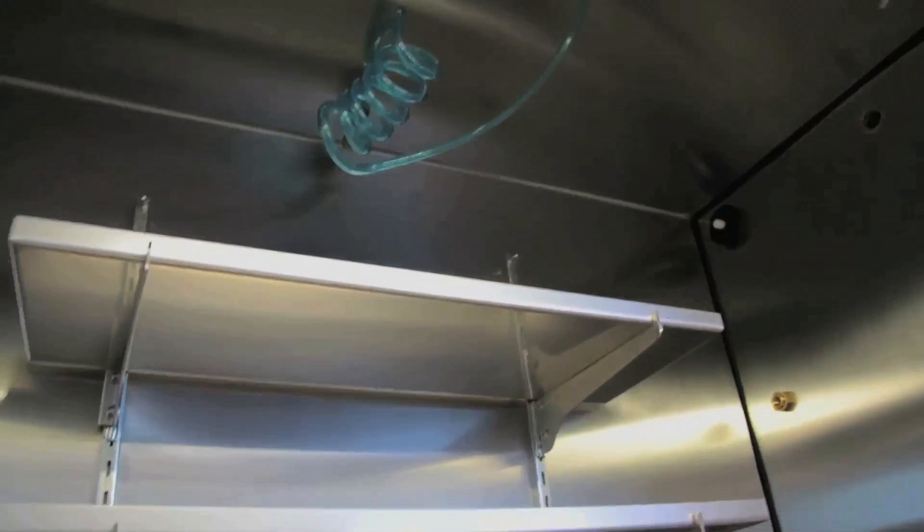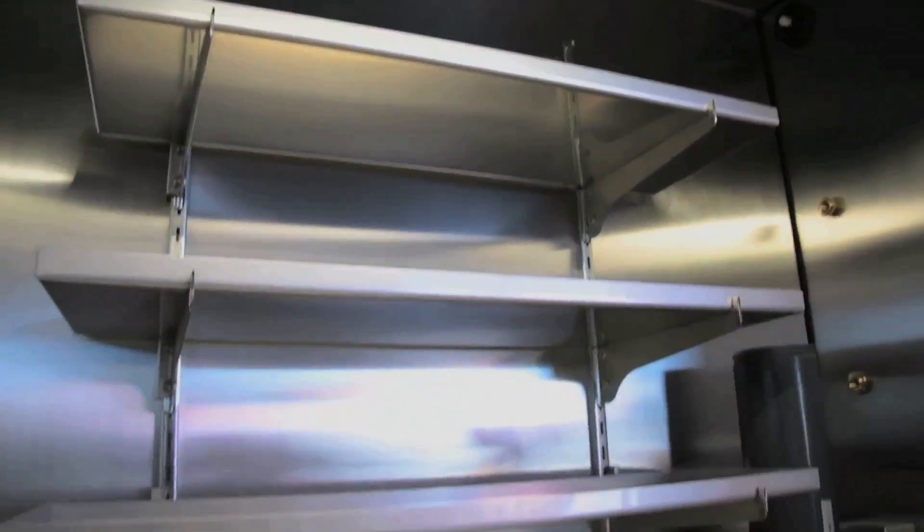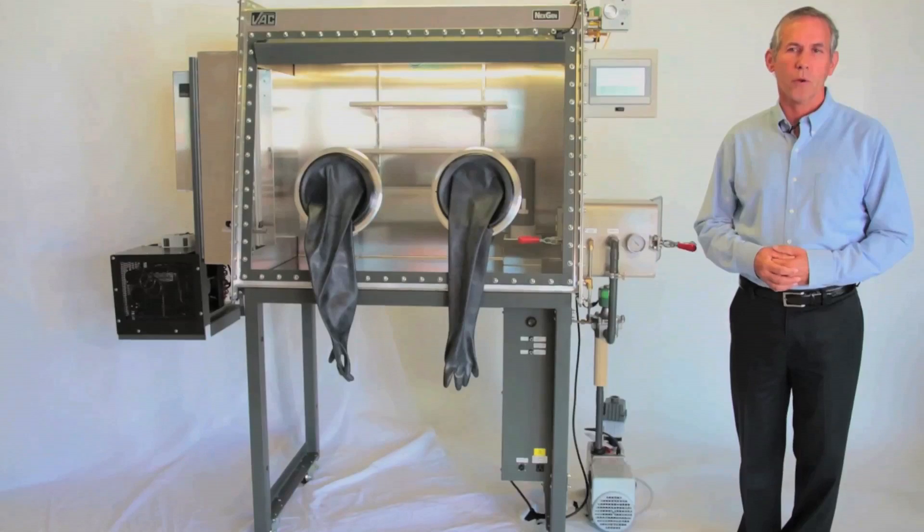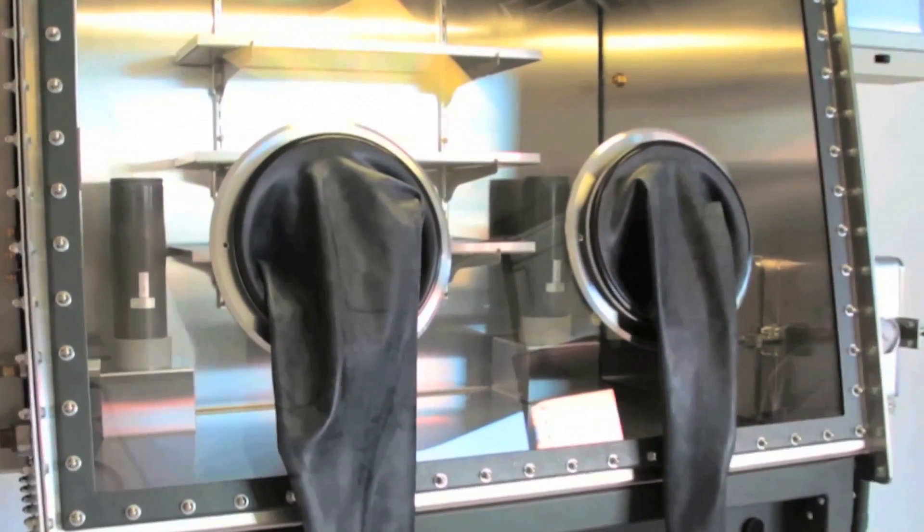The NextGen will maintain an inert atmosphere with less than 1 ppm oxygen and moisture. It uses two separate compact purifiers, one each for oxygen and moisture removal.